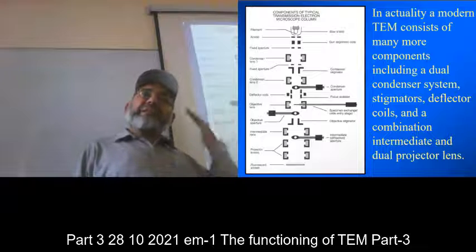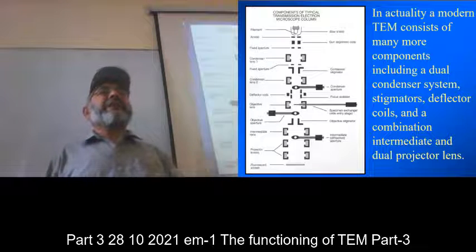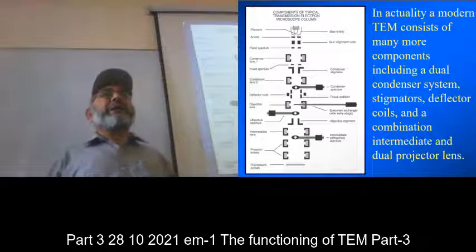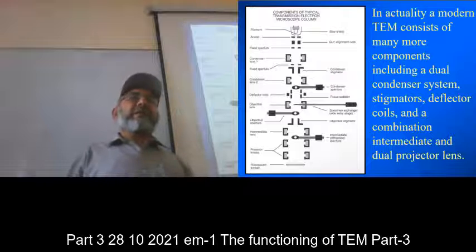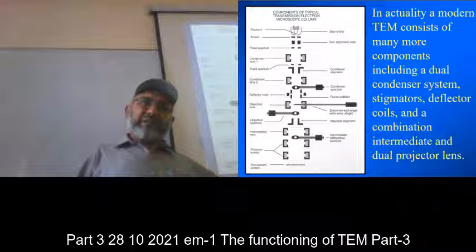After that, the machine developed was the conventional scanning electron microscope. Conventional means that it has a micron level resolution, and you can look into a polycrystalline material where the size of the crystals is from 1 micron up to a few microns.